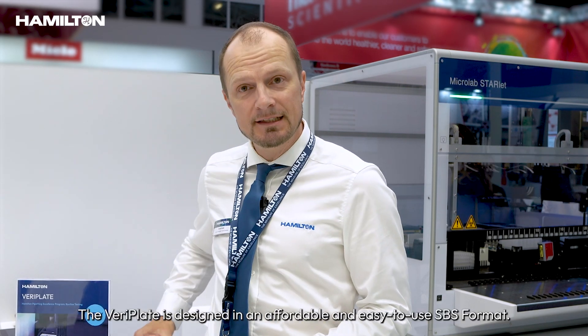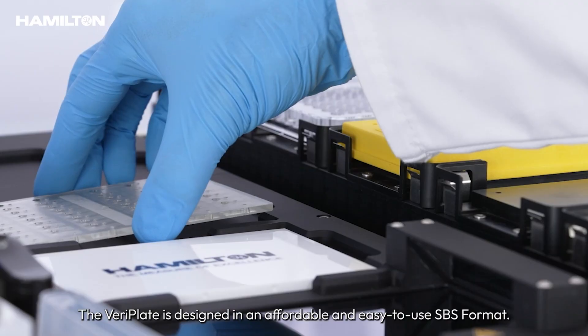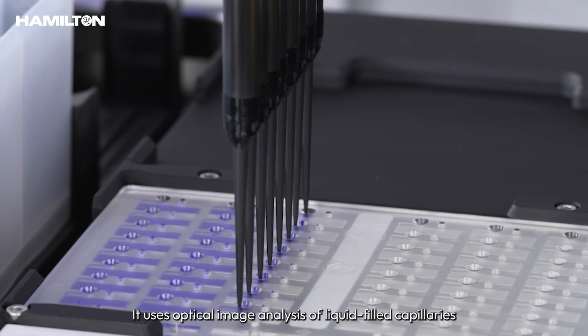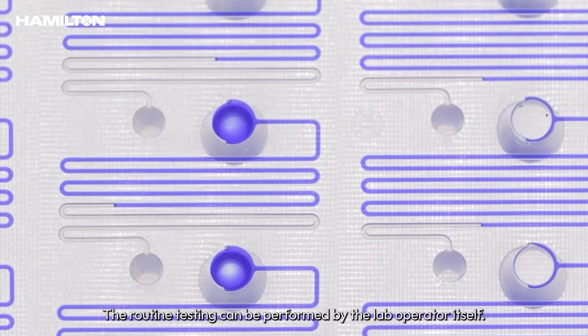The VeriPlate is designed in an affordable and easy-to-use SBS format. It uses optical image analysis of liquid-filled capillaries to ensure accuracy. The routine testing can be performed by the lab operator itself.